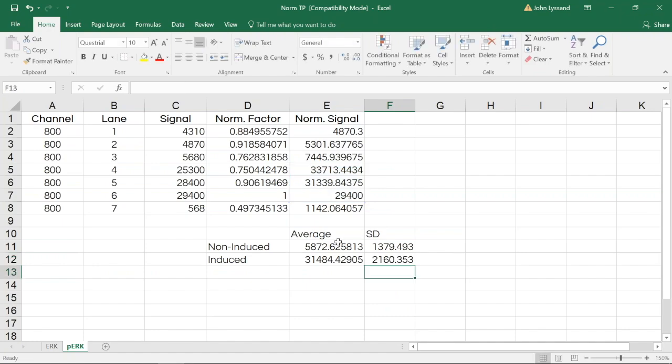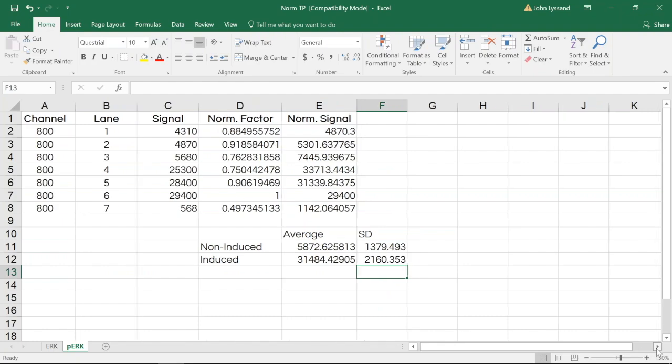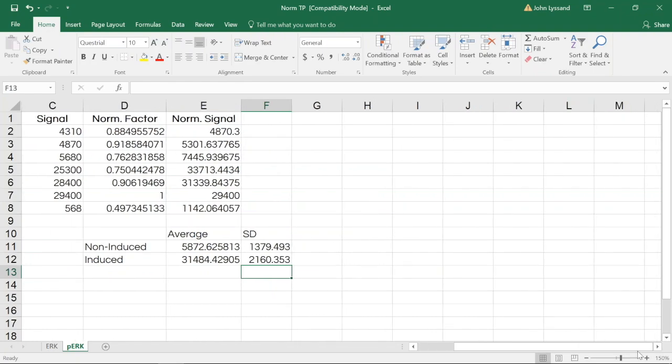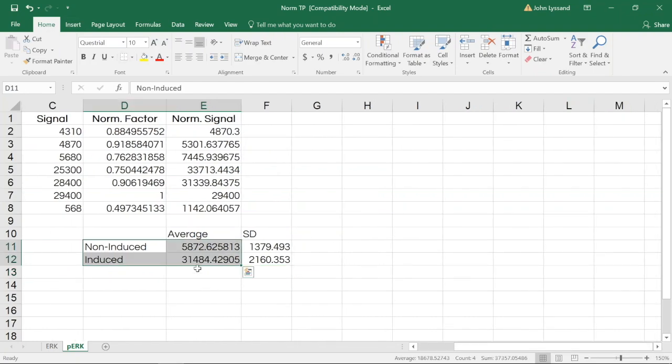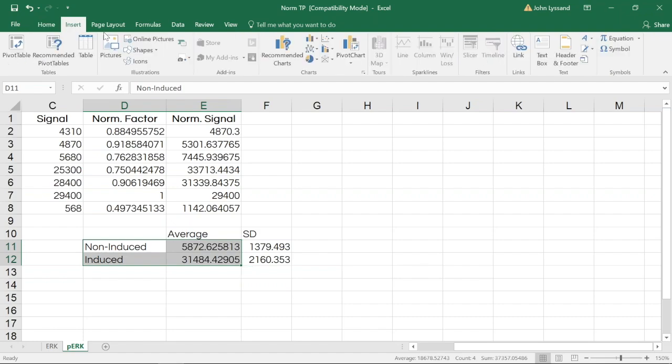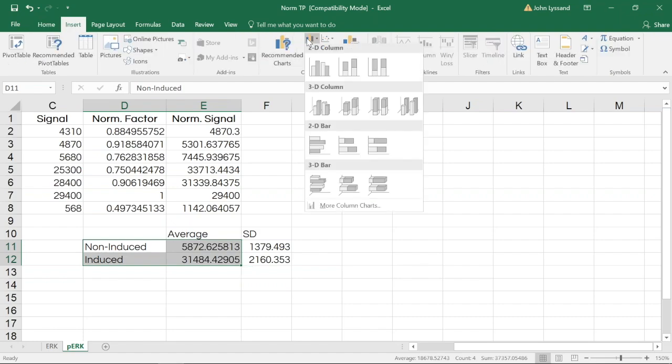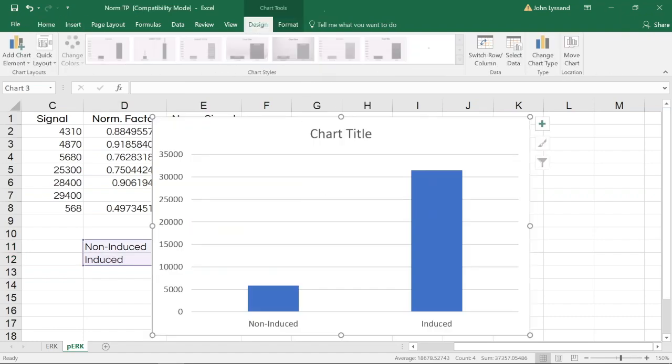Now we've calculated what the average and standard deviation from each data set is. If we want to go one step further in Microsoft Excel, we can select our data set and use charting functionalities to generate plots of our data.